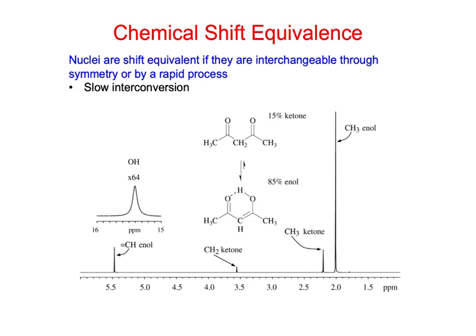So in this case, what we have are two equilibrating molecules. Okay, and so this is going from the keto form to the enol. So this is a tautomerization. So it's in equilibrium, and what we see depends a lot on how rapidly this would take place.